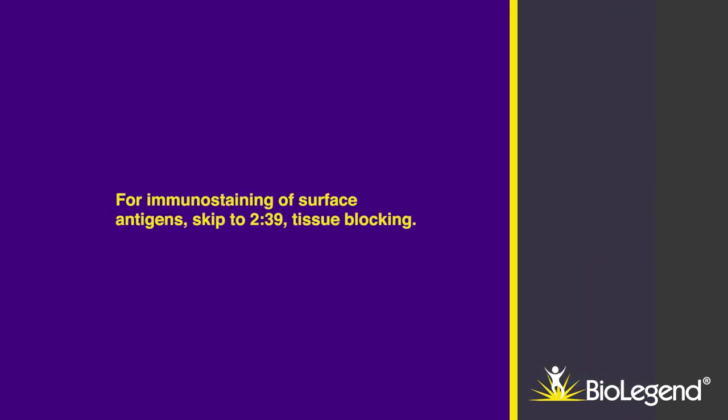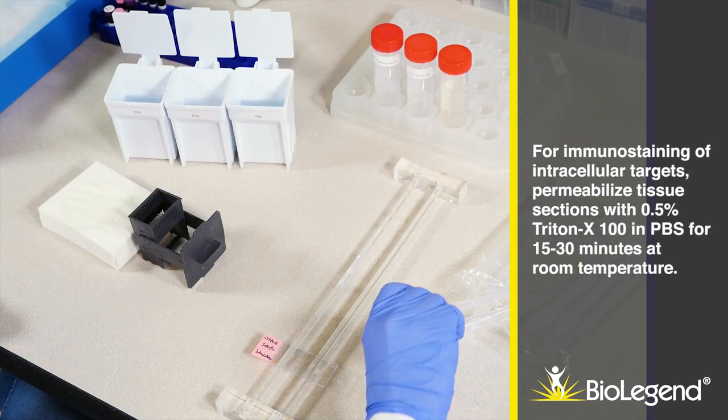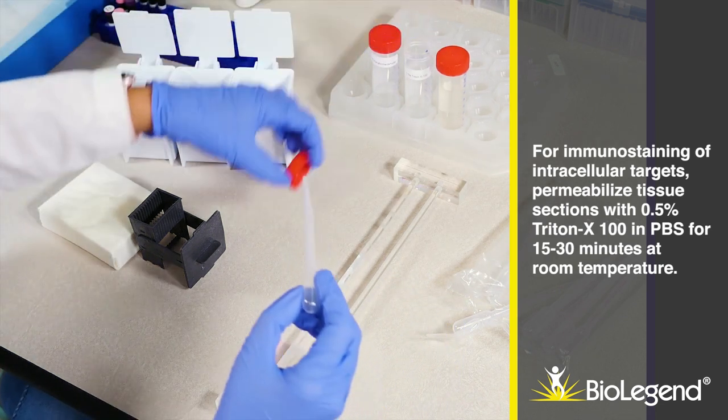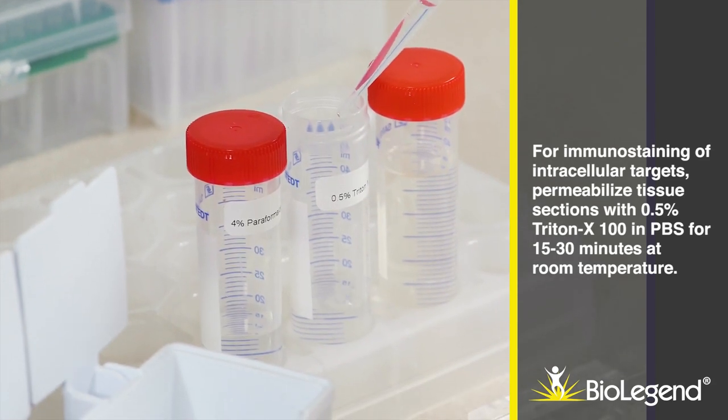For immunostaining of surface antigens, skip to tissue blocking. For immunostaining of intracellular targets, permeabilize tissue sections with 0.5% Triton X-100 in PBS for 15 to 30 minutes at room temperature.